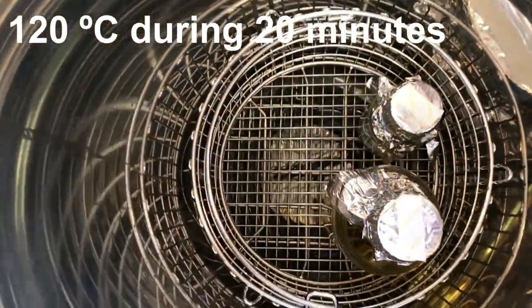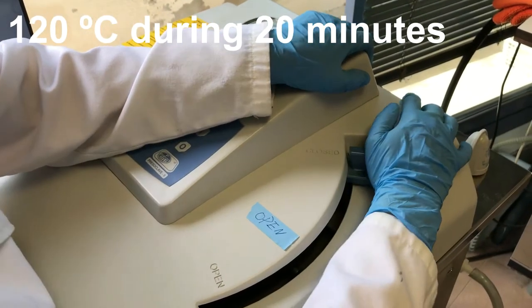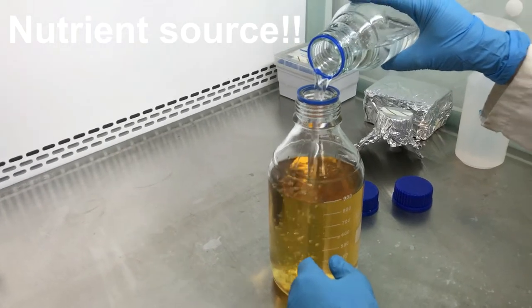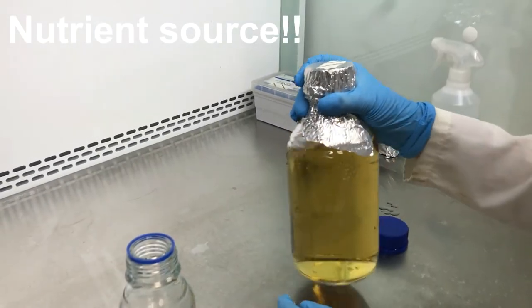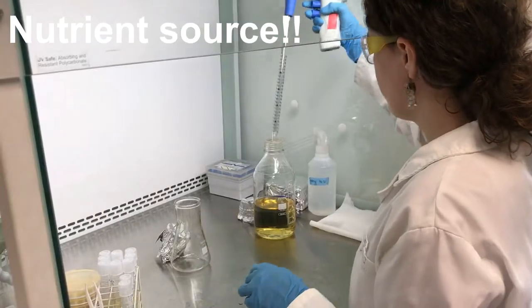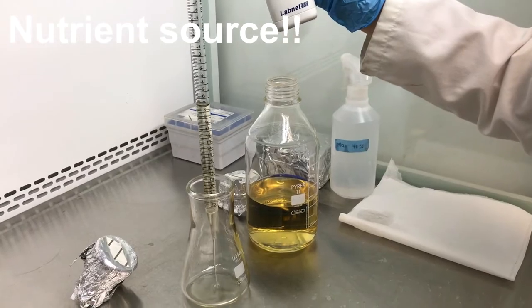Once they are cooled down, we mix them together and we obtain the nutrient source. We place some of it in a flask, such as an Erlenmeyer. And then we add the bacteria.